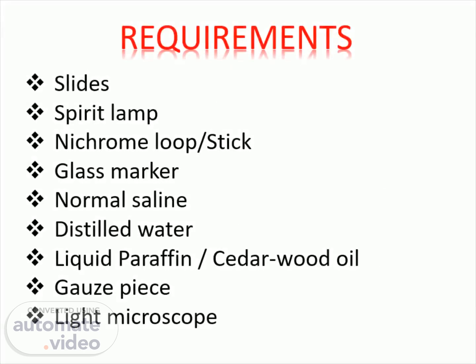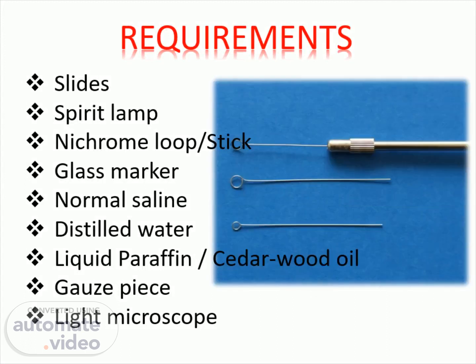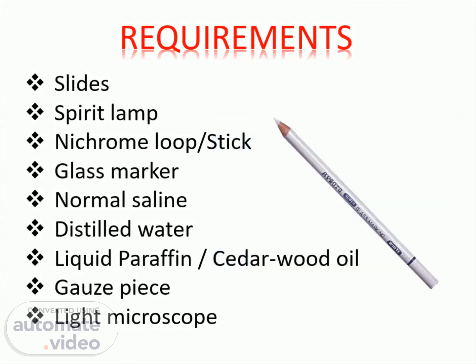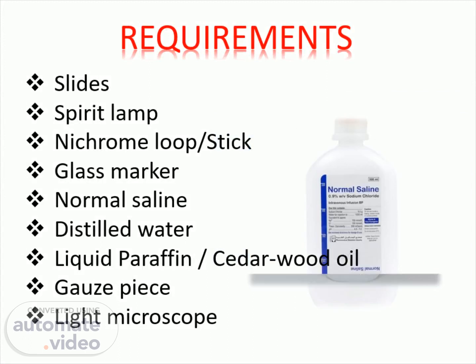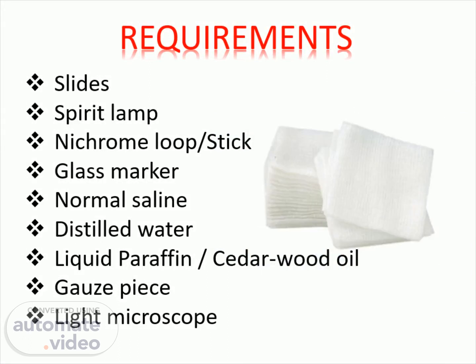What are the requirements? Slides, spirit lamp, nichrome loop or stick, glass marker, normal saline, distilled water, liquid paraffin, cedar wood oil, gauze piece, and a light microscope.